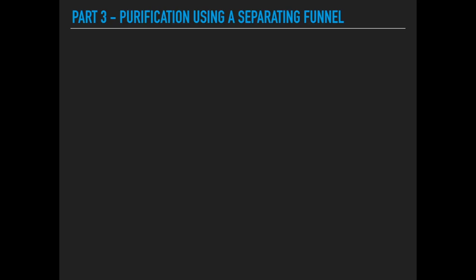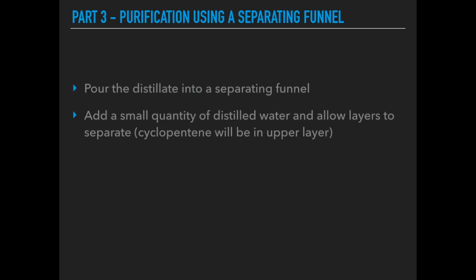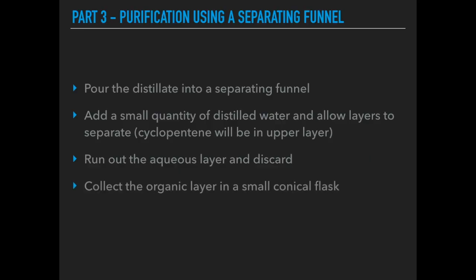For part three, purification using the separating funnel: pour the distillate into a separating funnel. There may be water-soluble impurities in the product, so add a small amount of distilled water and allow the layers to separate. Cyclopentene will form the upper layer because it is less dense than water. The impurities will be in the lower aqueous layer — run that out and discard it. Then run out the organic layer and collect it in a small conical flask. Because there may still be a small trace of water in the product, add a drying agent — anhydrous calcium chloride.